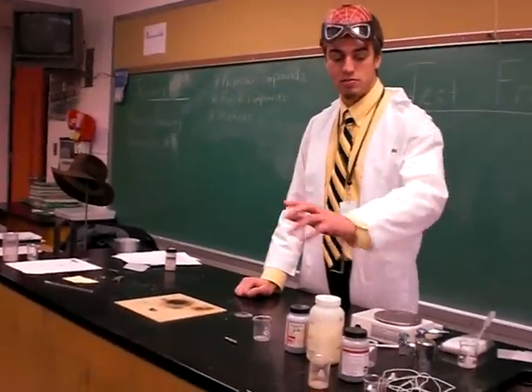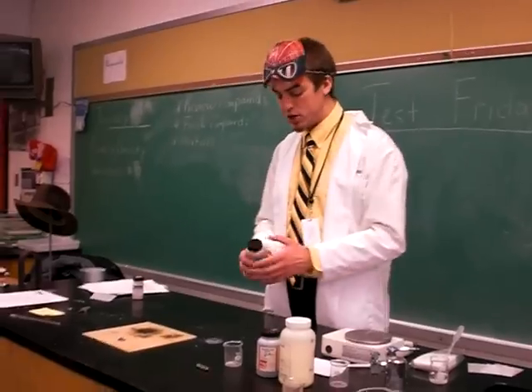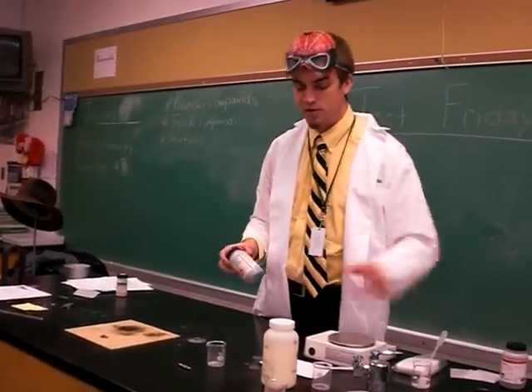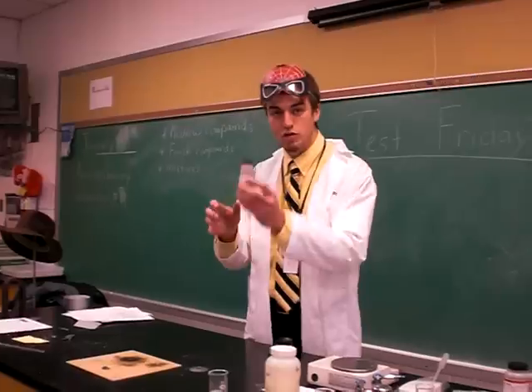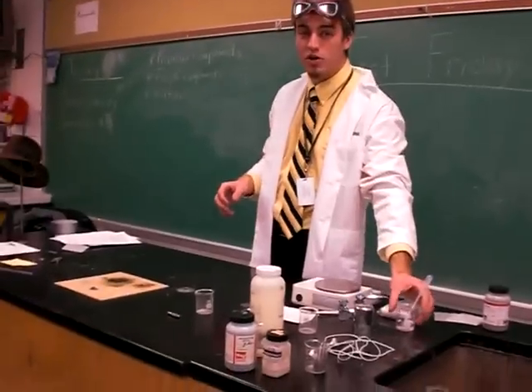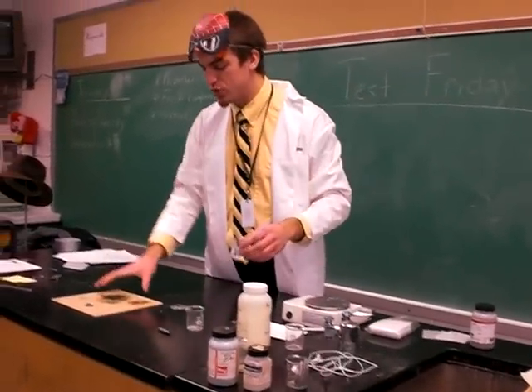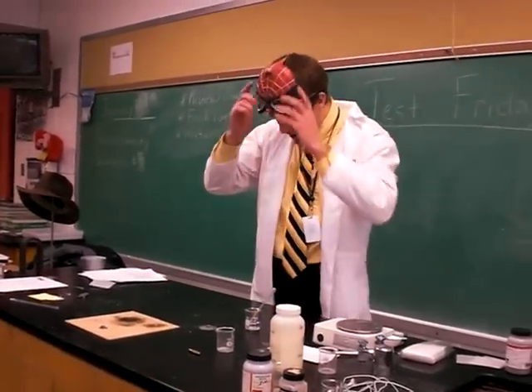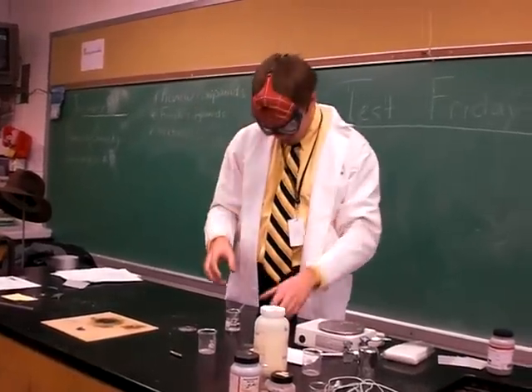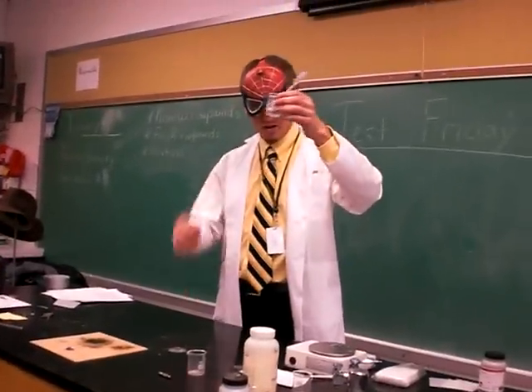We have two things in our mixture: we have magnesium — a fun element — and silver nitrate. This is our mixture here. To start this reaction, we need a drop of water that I have right here in this container.